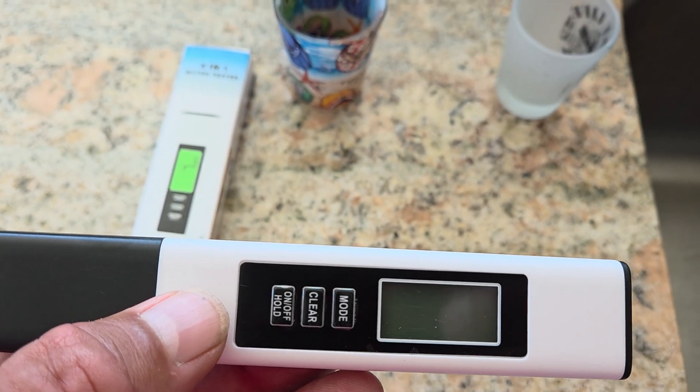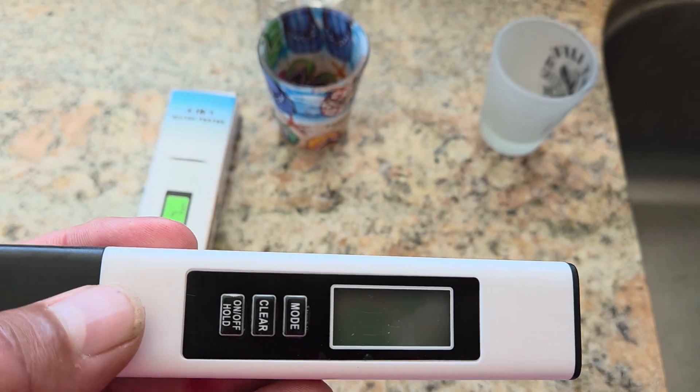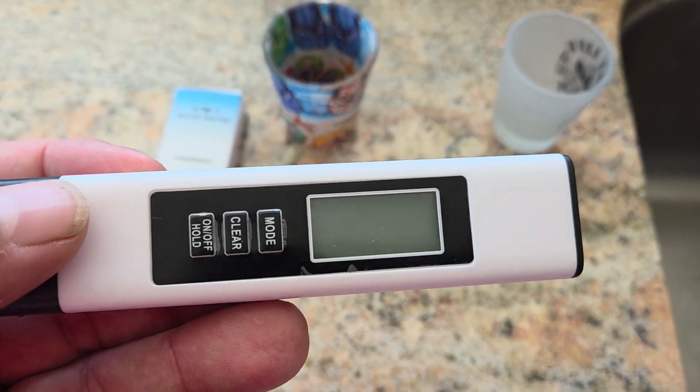Ever wonder how good your water is, whether it's coming out of your tap or your refrigerator? Well, now you can test it.